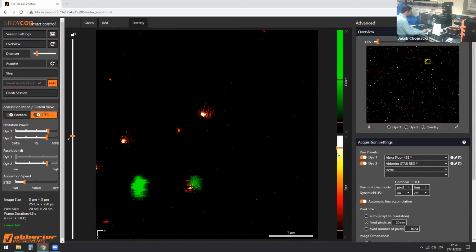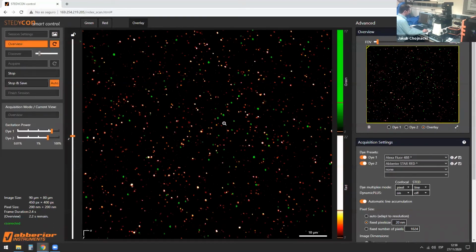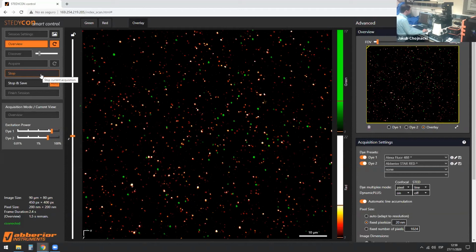It's very, very diffuse. So it's not the greatest signal, but we see, I would estimate, that there are only 1 or 2 spike proteins on the surface here. Well, this actually tells me something already about the sample in general. I think this preparation of virus-like particles does not seem to have very many spike molecules on the surface. As you remember from HIV, there was quite a lot of orange signal, HIV virus particles having quite a lot of envelope proteins.